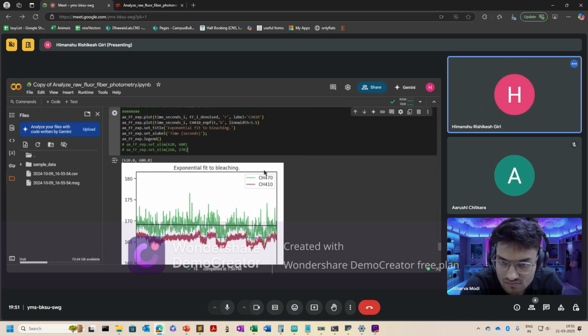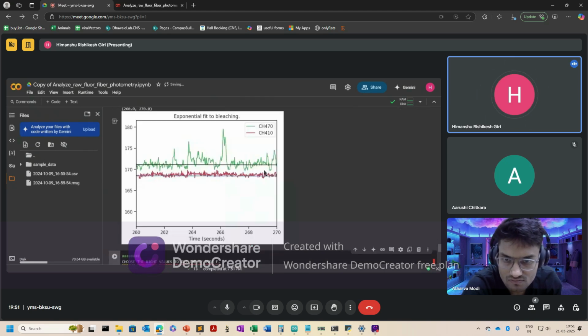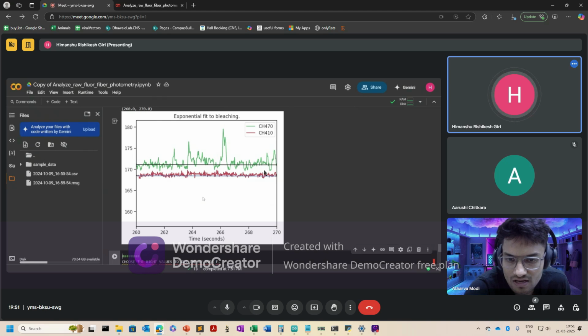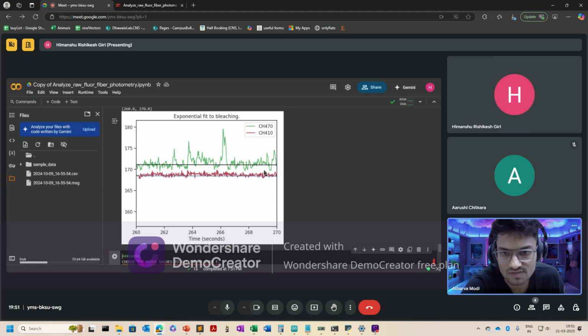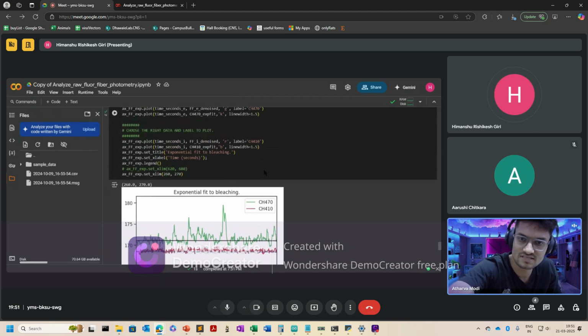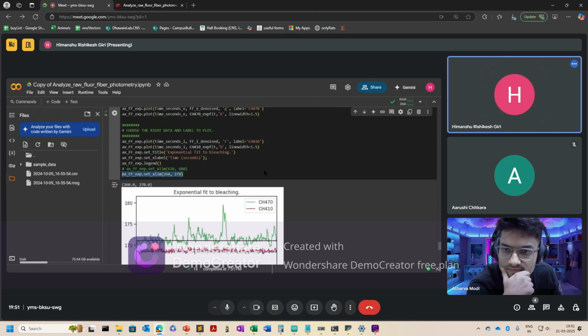Within a short time window, it will not change much. But if you plot it in the same cell twice, one with an x limit towards the end, let's say 1900 or something, and one at this 260, so just copy everything and plot it twice.